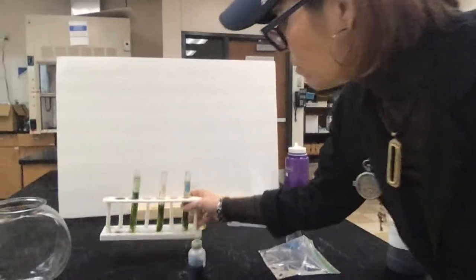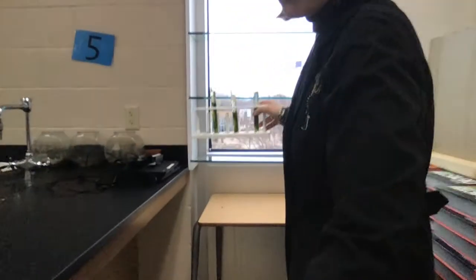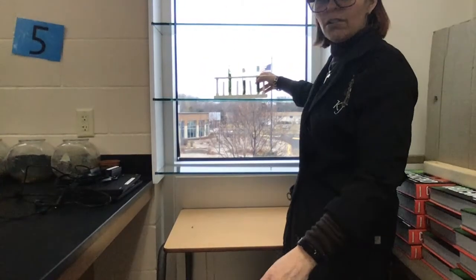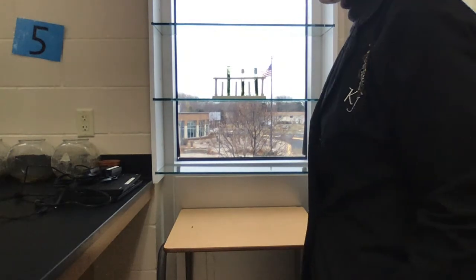Now I'm going to walk you over. You'll just have to trust me that I'm putting some corks on these so that none of our gas escapes. And I'm going to go ahead and set them here in the window. And then we'll check on those periodically over the next few hours. All right, I'm going to go ahead and pause here. I've got to get a test started.